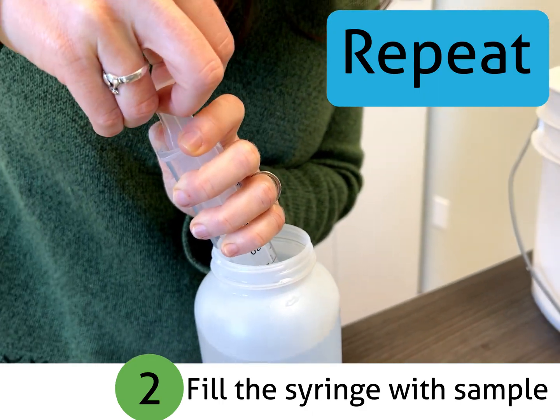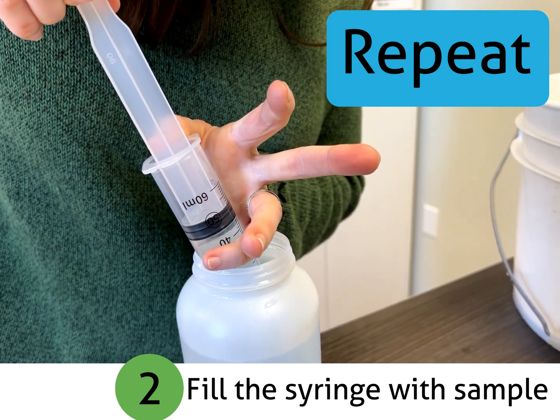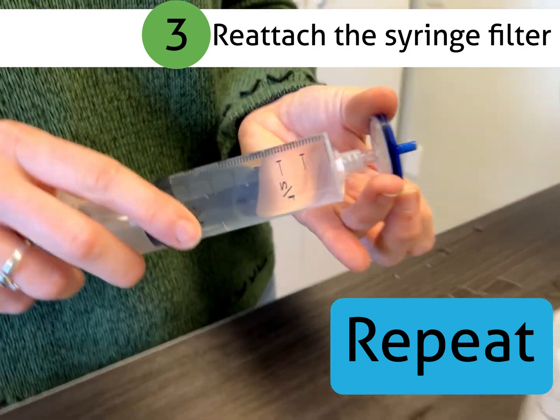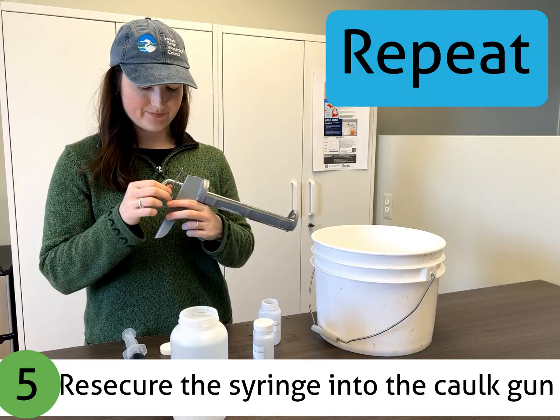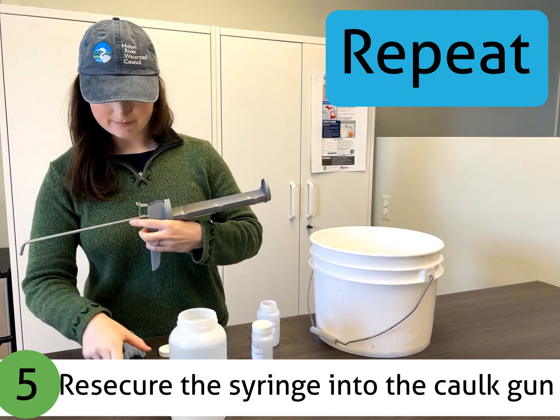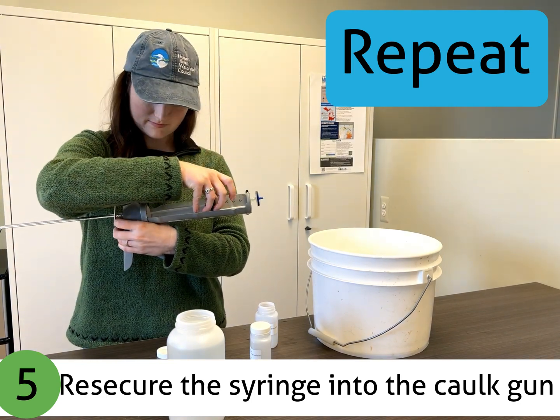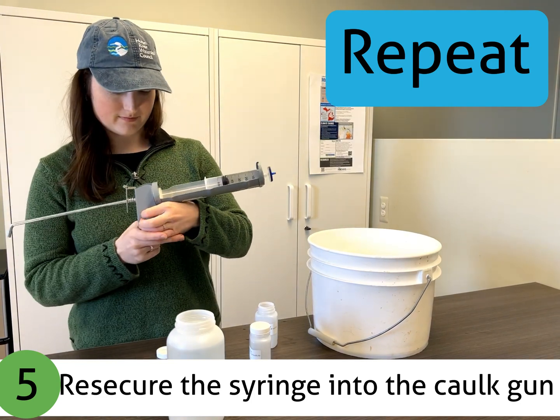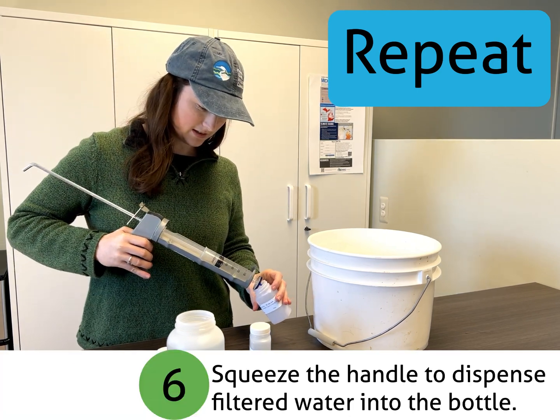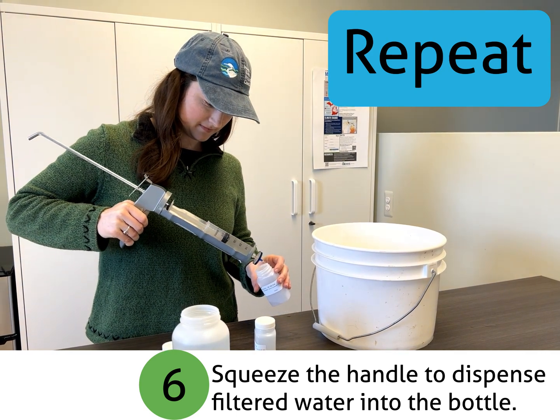As a reminder, those steps are to fill the syringe with sample only after you have taken off the filter, then reattach the syringe filter, and then re-secure the syringe into the caulk gun. Finally, squeeze the handle to dispense the remainder of the filtered water into the bottle until it is full.